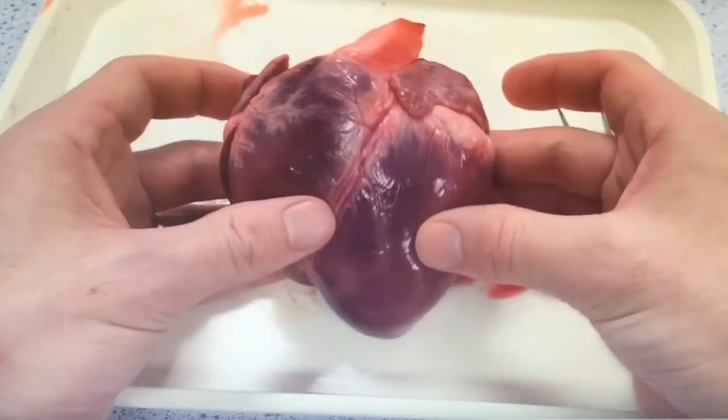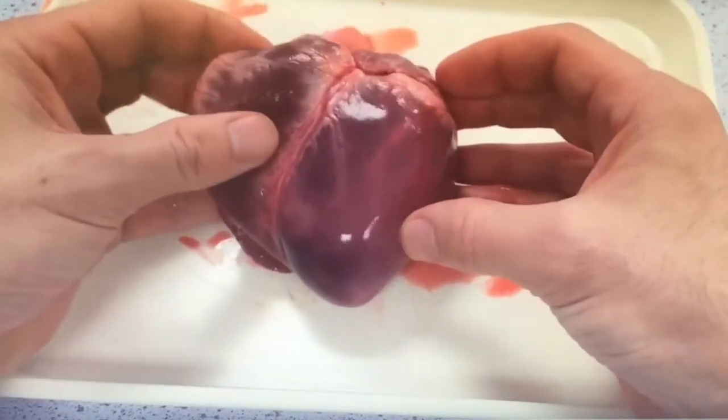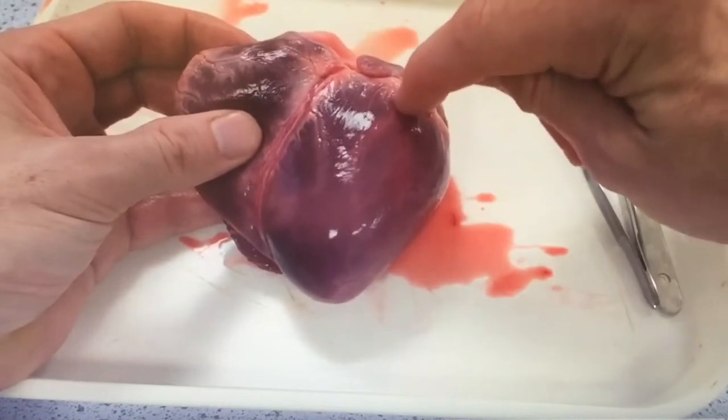So before you dissect the heart, have a look at it from the outside, the gross structure, find your way around it, take some photographs, and then annotate those photographs and notice all the main features.